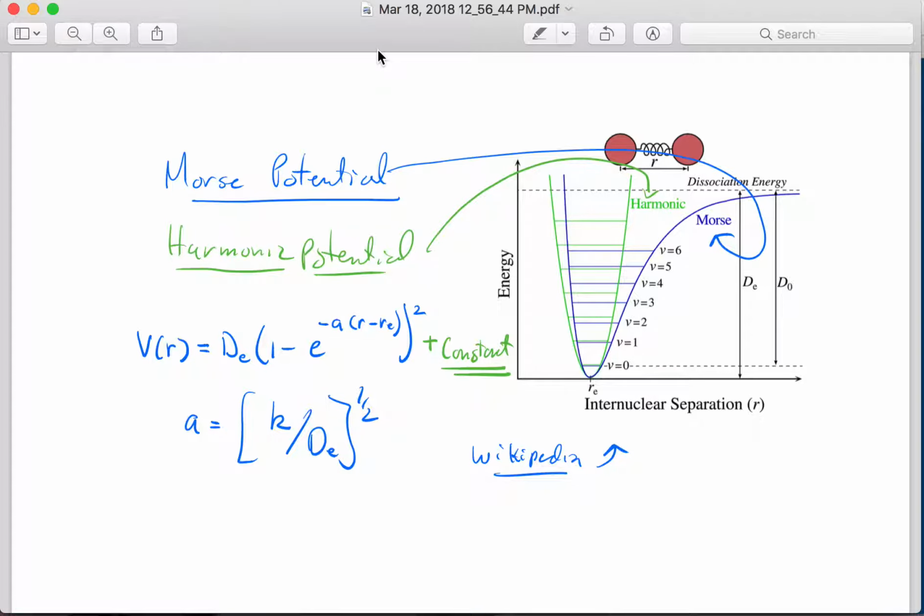What I'd like to emphasize first is that in the lab we're making a measurement of the UV-Vis spectrum, and we'll be backing out information about the ground and excited state electronic potential. One way to model that, as we saw in the handout from Gerlach et al., is by a curve that looks something like the blue one here, which we're going to call a Morse potential. From the data you get in the lab, you'll be able to calculate things related to that Morse potential. But it's also interesting to try to do a quantum mechanical calculation to calculate that same thing.